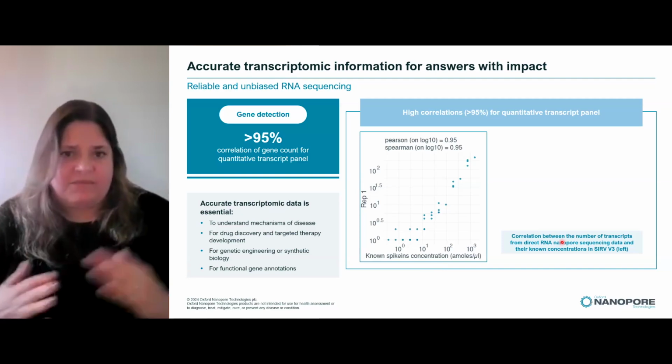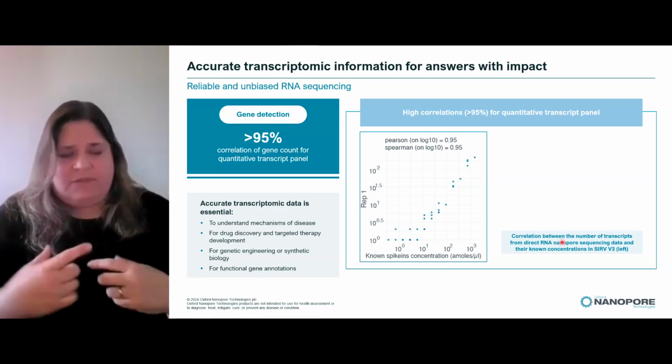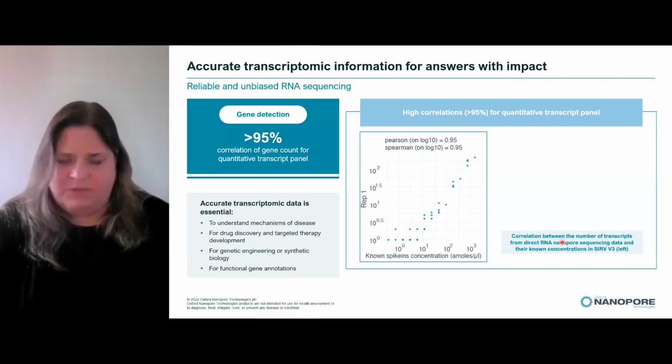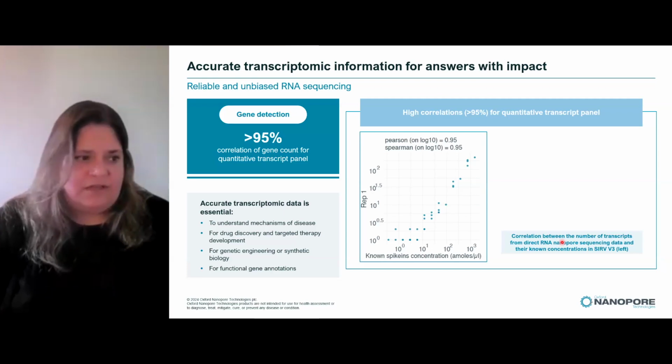Again, with the replicates, we can measure that and look at biological replicates. How often does this happen? And what are the dynamic ranges of what we're being able to see? And this helps people to develop drugs or targeted therapies. And we can do this with confidence because we know that, expected versus observed, we are getting high correlations between that.